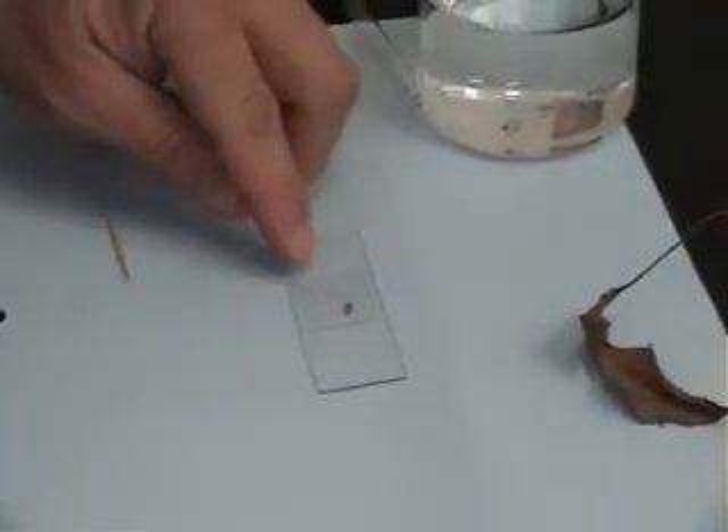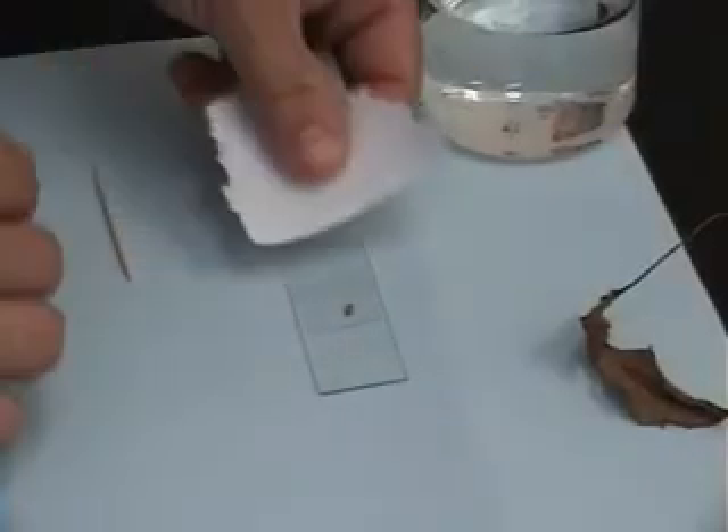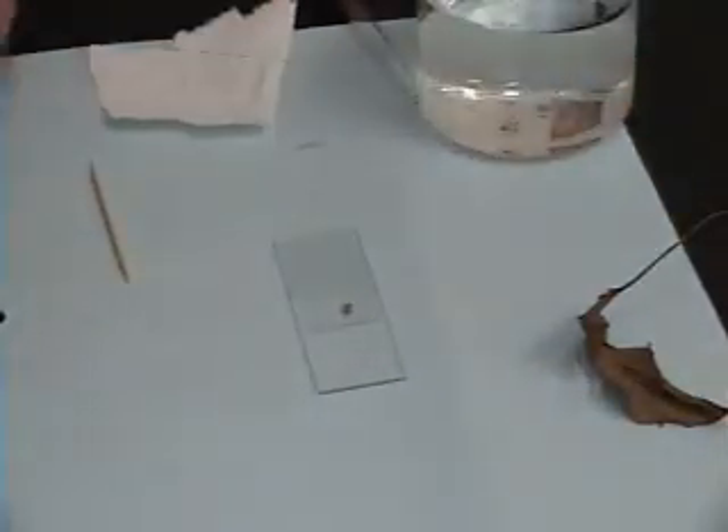That's how you create a wet mount slide. Sometimes, if you have water around the edges, you can blot it a little bit with a paper towel, like so. Now you have your wet mount slide created.